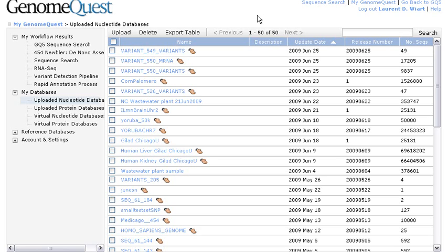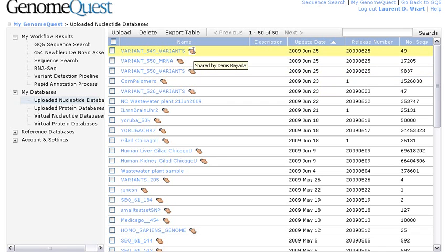Here on this page, you can see the My Genome Quest page, which is the page where I have all my results stored, and among them, the list of uploaded nucleotide databases I've sent to the Genome Quest server. As you can see, there's a lot, and most of them have been shared with me by some friends.